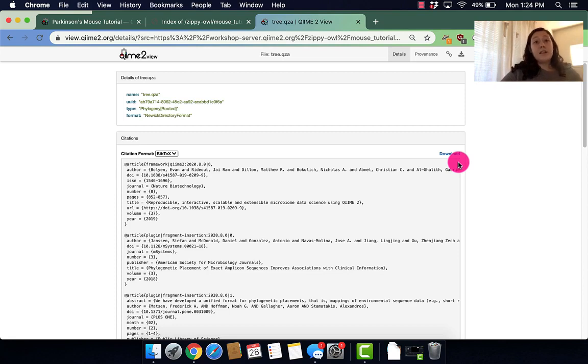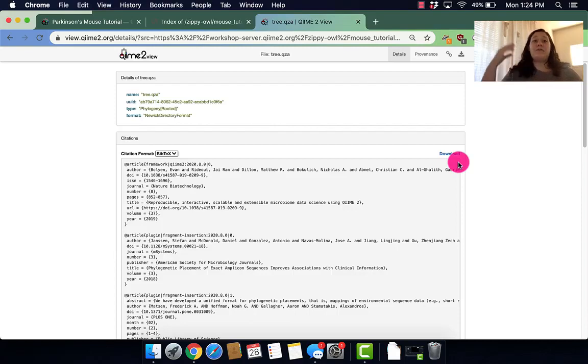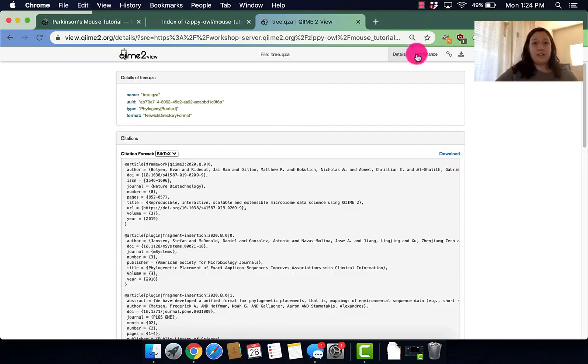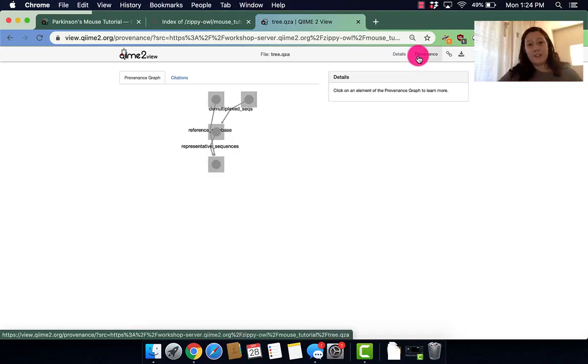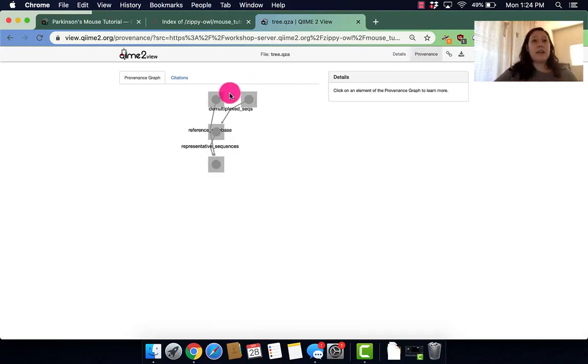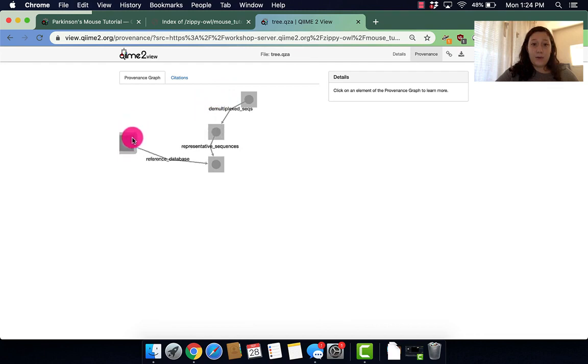So something to note is that this is a QZA. A QZA doesn't really create a visualization like we've seen in our previous tutorials. So this is just more information. But let's just take a look at that little provenance real quick.